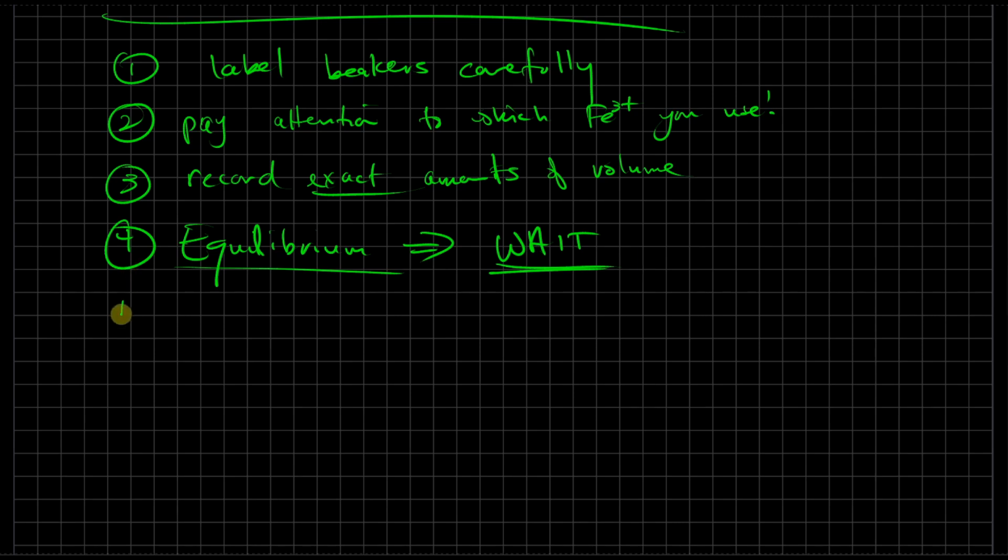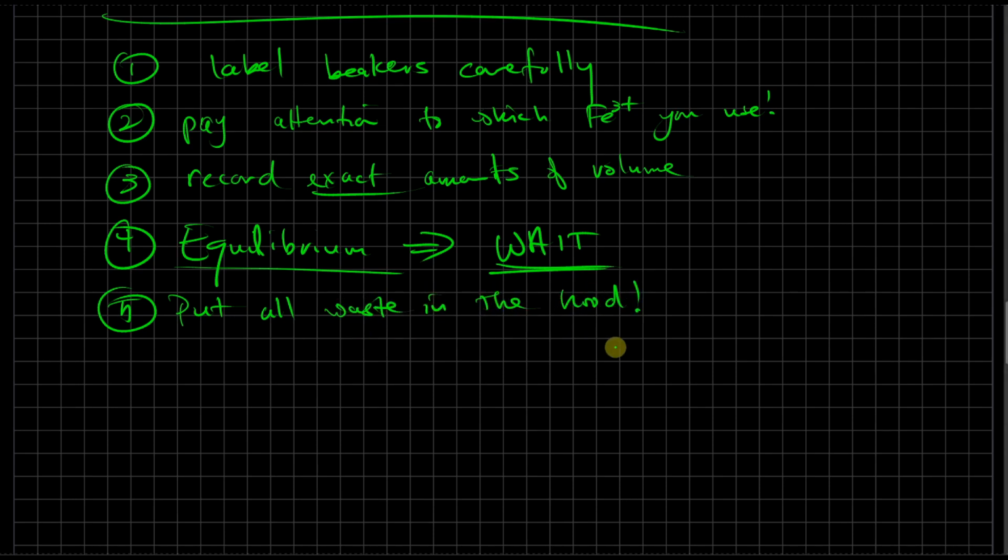And then the last thing for cleanup, put all waste in the hood. There'll be a special container in the hood to put all the waste in.